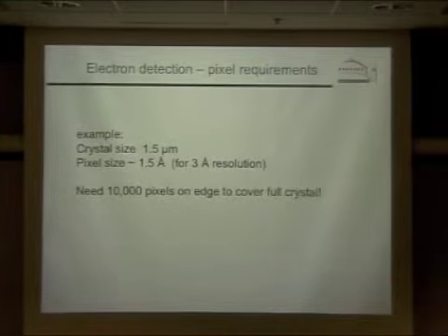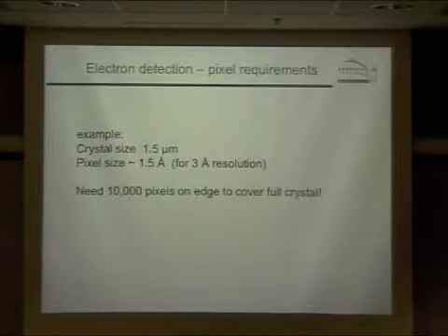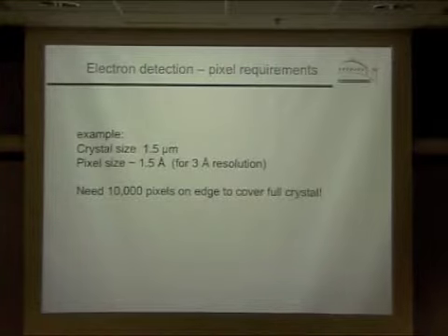So in fact, we always used to digitize our tubulin images at sort of 4,000 to 6,000 pixels on edge, but that's because we also would go to lunch or go home for the night while we were running an unbending process, because Fourier transform of a 6,000 pixel array would take half an hour if we were using the computer all by ourselves, and maybe overnight if there was anybody else who was trying to do something.